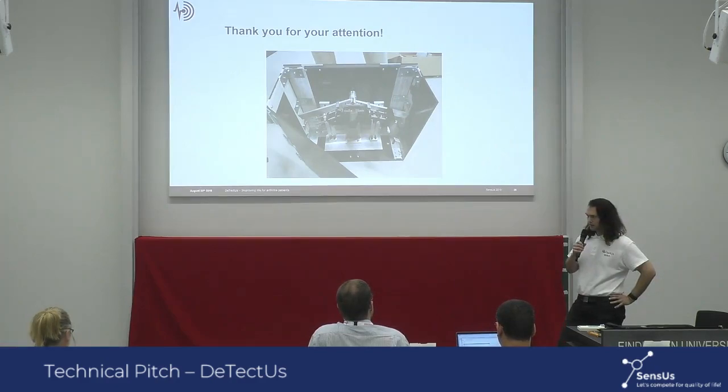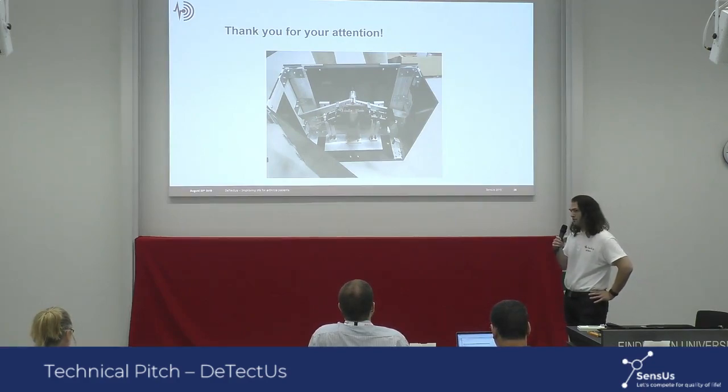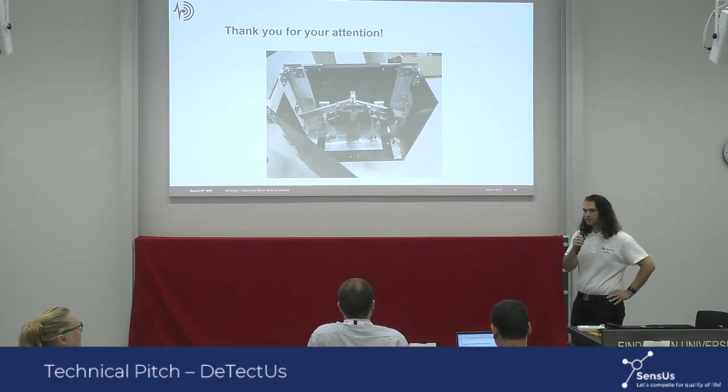We did a baseline measurement as soon as we placed the drop, and use that as a reference. And then for the plasma case, we saw that it gave a negative response, but it was basically zero.